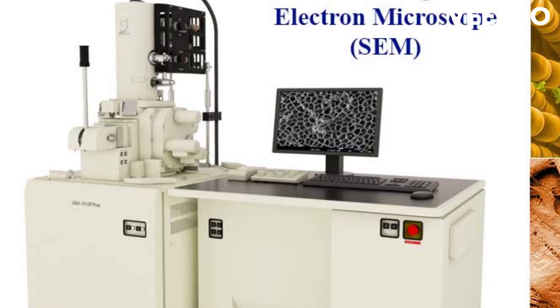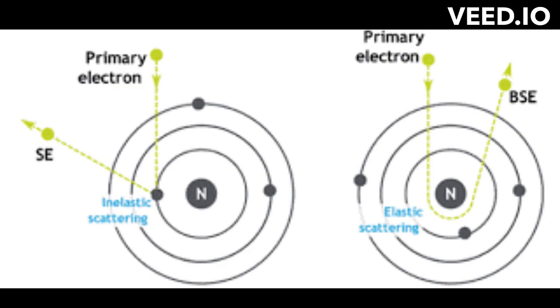But a scanning electron microscope is still a microscope. Thus, all the features you see under a petrographic microscope can still be seen in a scanning electron microscope. You will see the borders of your mineral, cleavages of micas if you increase magnification of course, textures, exsolution, and many others. SEM relies on the detection of high-energy electrons emitted from the surface of a sample after being exposed to a highly focused beam of electrons from an electron gun. This beam of electrons is focused to a small spot on the sample surface using the SEM objective lens.